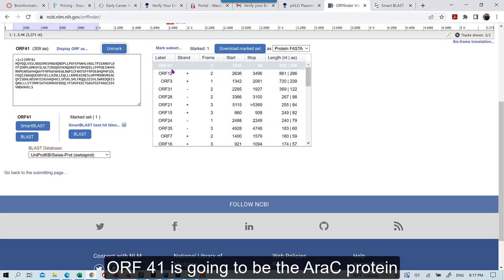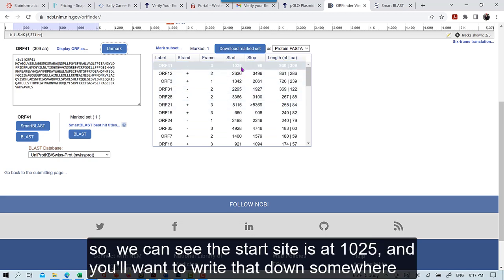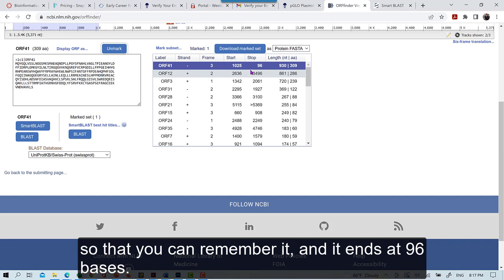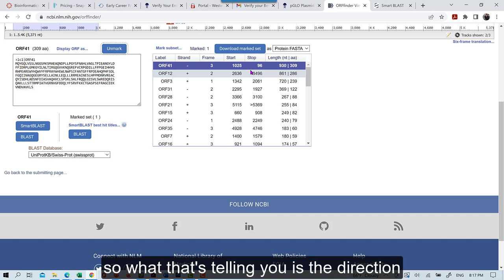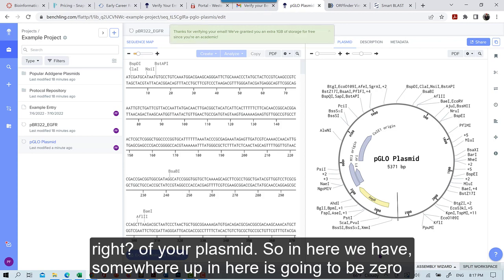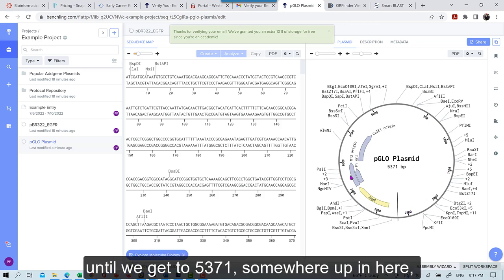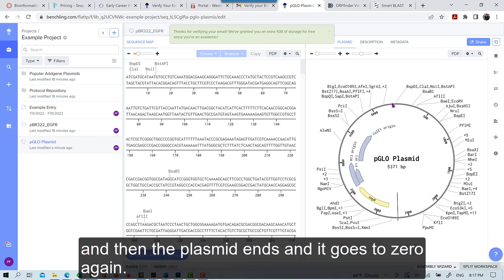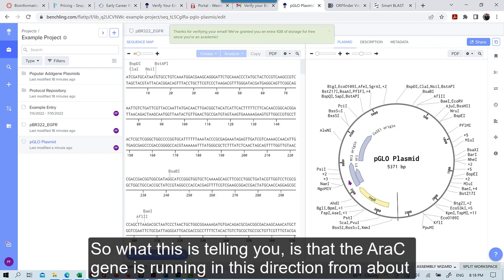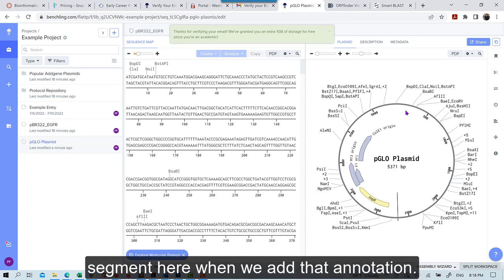ORF 41 is going to be the AeroC protein. So we can see the start site is at 1025, and you'll want to write that down somewhere so you can remember it. And it ends at 96 bases. So what that's telling you is the direction, right, of your plasmid. So in here, we have somewhere up in here is going to be zero, right, and then we start moving in this clockwise direction on our plasmid until we get to 5,371, somewhere up in here. And then the plasmid ends, and it goes to zero again, and then you start over. So what this is telling you is that the AeroC gene is running, right, in this direction from about 1,000 bases down to about 96 bases. And so we will want that arrow to show up in this segment here when we add that annotation.